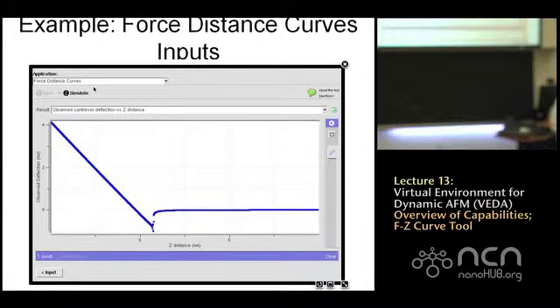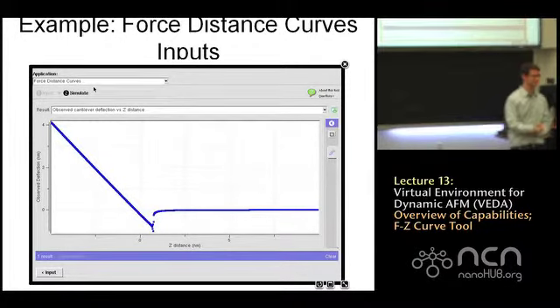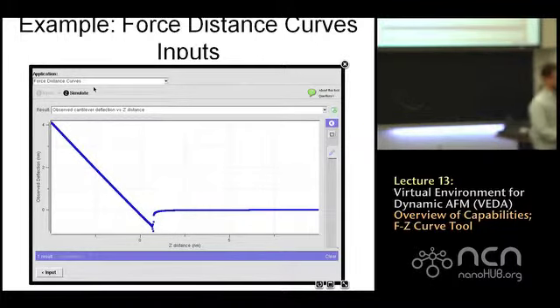What are the limitations of the model? Because if you solve all the differential equations, we know the indentation. Do you need to run a test? A real test? Well, that's optimistic, I think. You probably do want to do the experiment to ultimately get the indentation. Is that your question? The bottom line is this is based on a model where you know everything about the properties. If you know everything about the properties, why would you do this experiment? Yeah, quite concisely. Right, precisely.